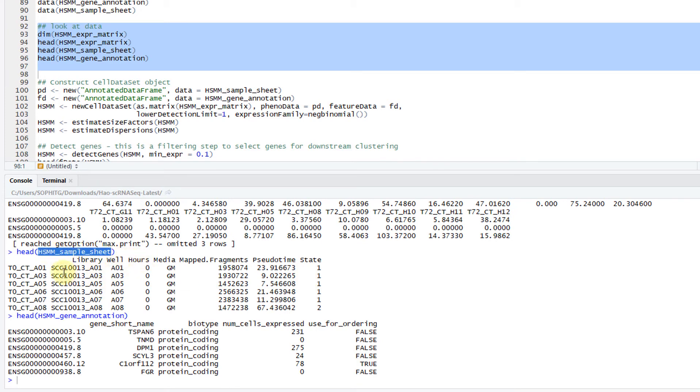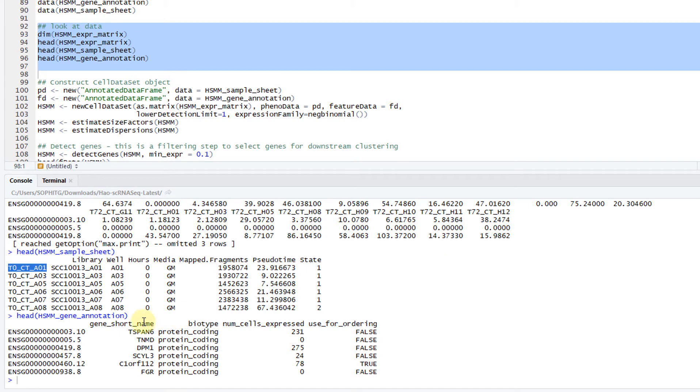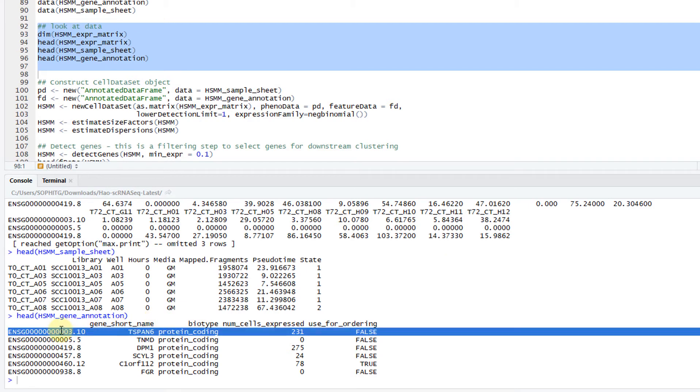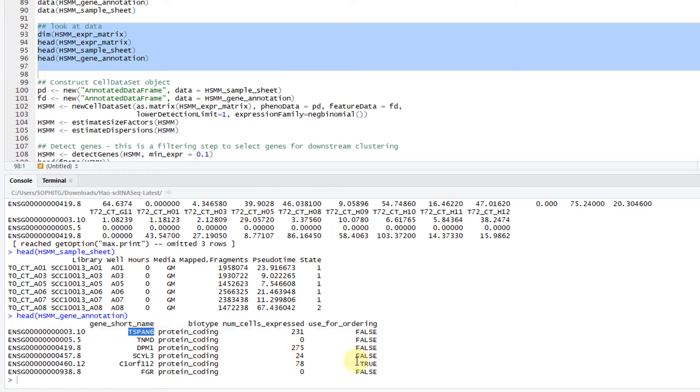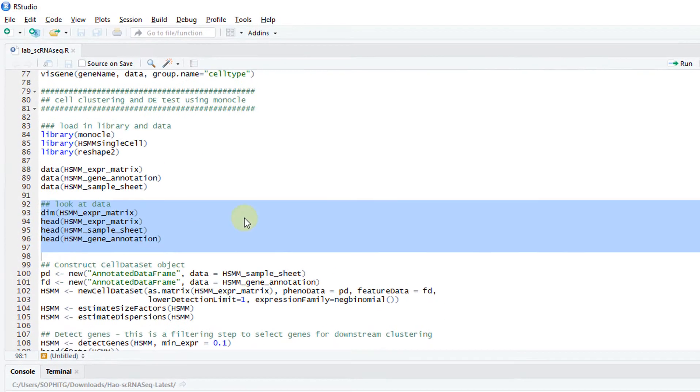Here are the sample sheets. Basically for each cell, what are they? This is the cell names. For each cell, it's a row. Here are the gene names, gene annotations for each gene. Here are the ensemble number, ensemble accession number, the gene names, and so on.